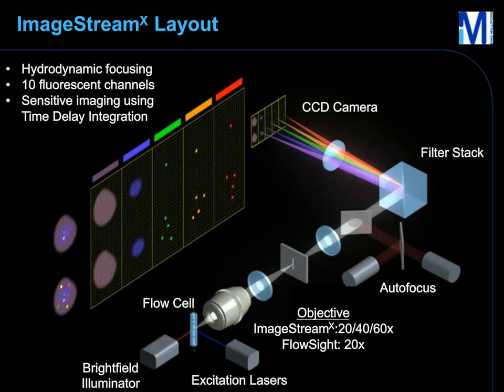Imagery from each channel is then captured using the CCD camera. What's interesting about this camera is that imaging is performed in a mode called time delay integration, which allows very sensitive collection of light, despite the fact that particles are moving when signal is collected.